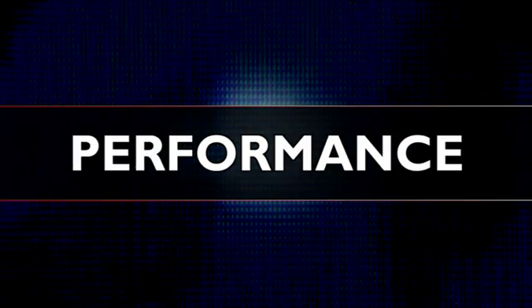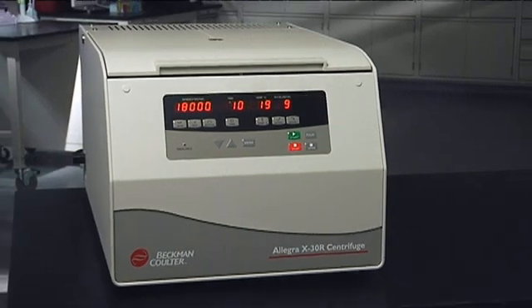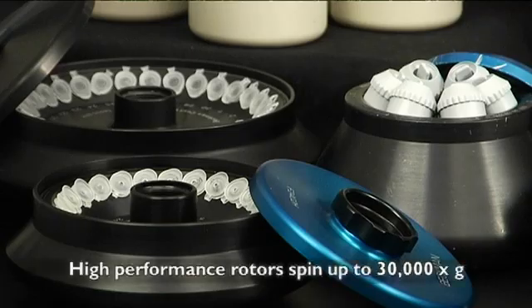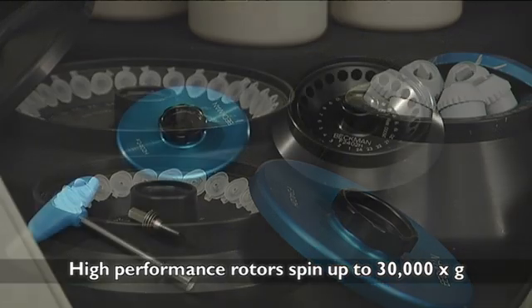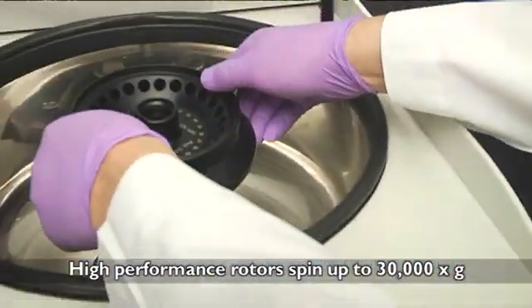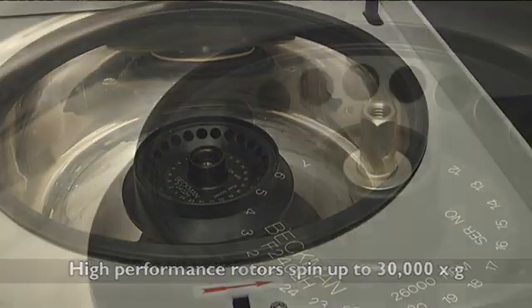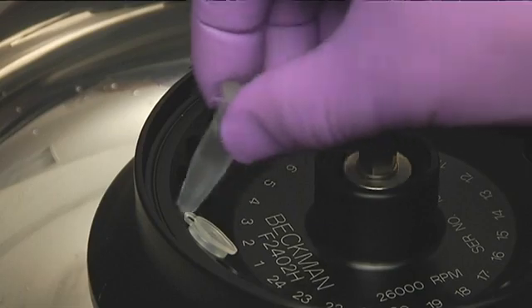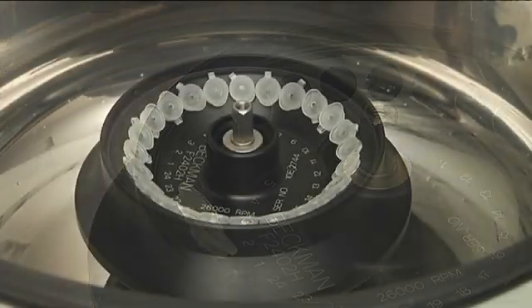Performance is established with class-leading RPMs and G-forces in a medium capacity centrifuge, with fixed angle rotors delivering up to 30,000 times G, helping you achieve your results more quickly. Our high-performance rotors run more applications and save you precious time in the lab — time you get back in your day to move from sample preparation to downstream processes.